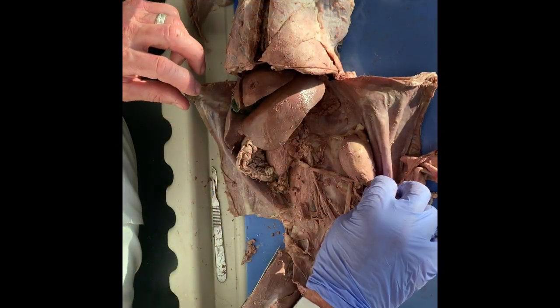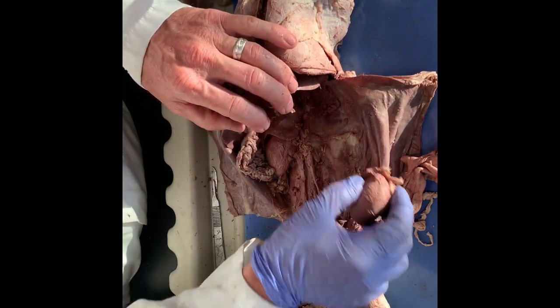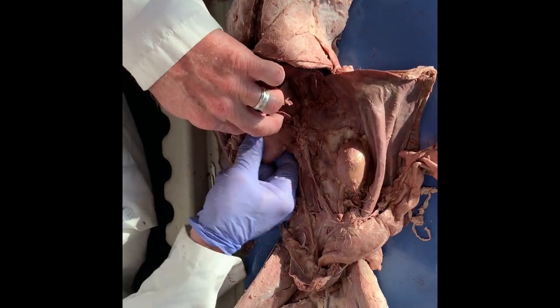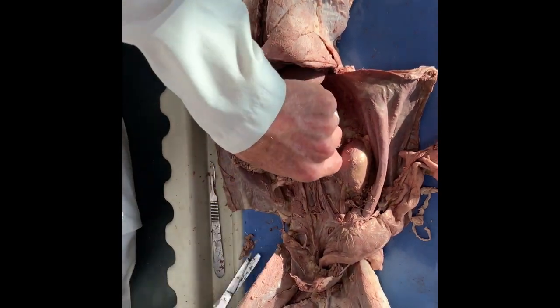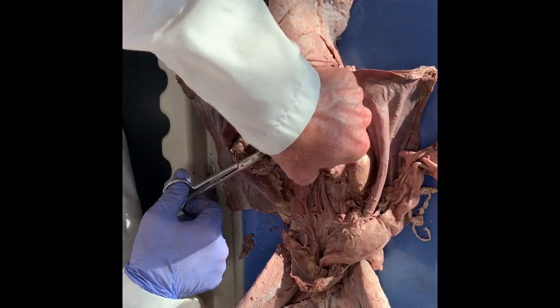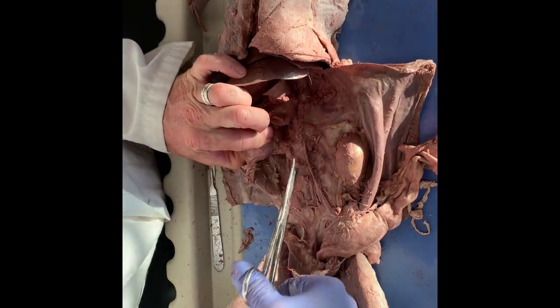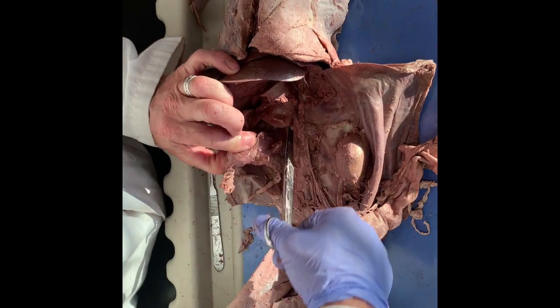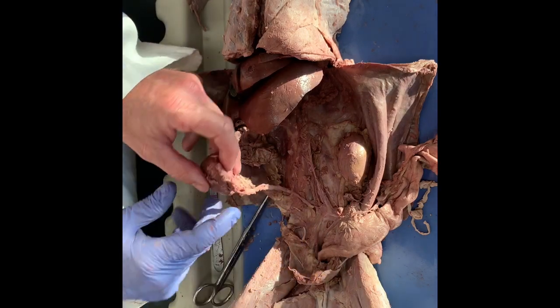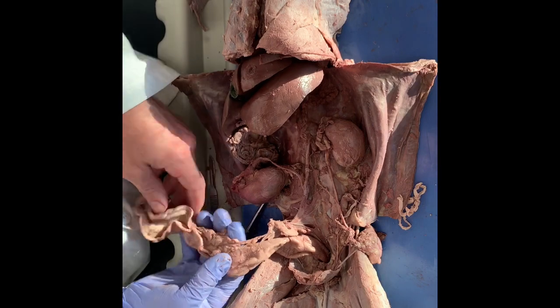Okay, so now I'm going to take out the ureters and the bladder. And so this kidney is free, okay? And then I'm going to remove this kidney. So I'm going to come over here, break the connective tissue that connects it to the dorsal wall. I'm going to come above the ureter, accidentally severed the ureter. Okay, so that's the right kidney. This is the left kidney. And then it all connects to the bladder.